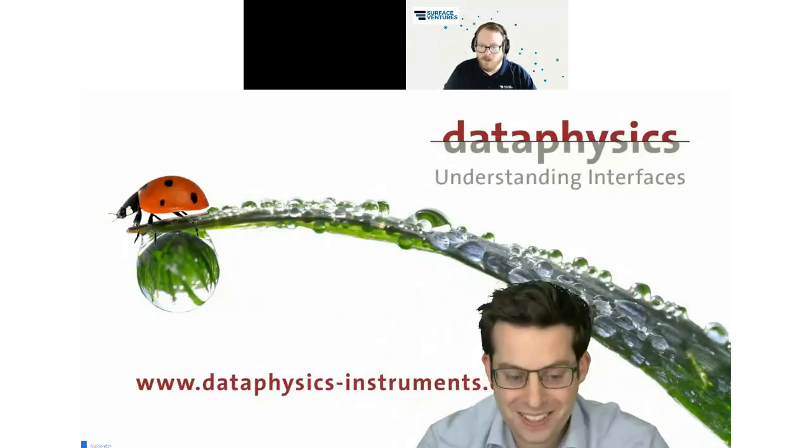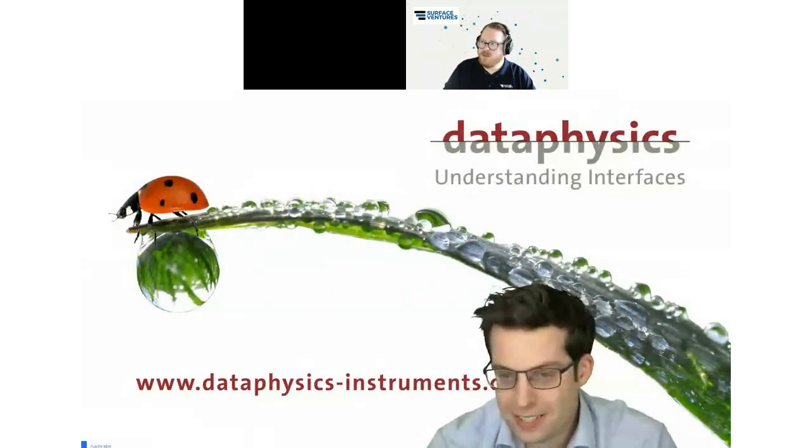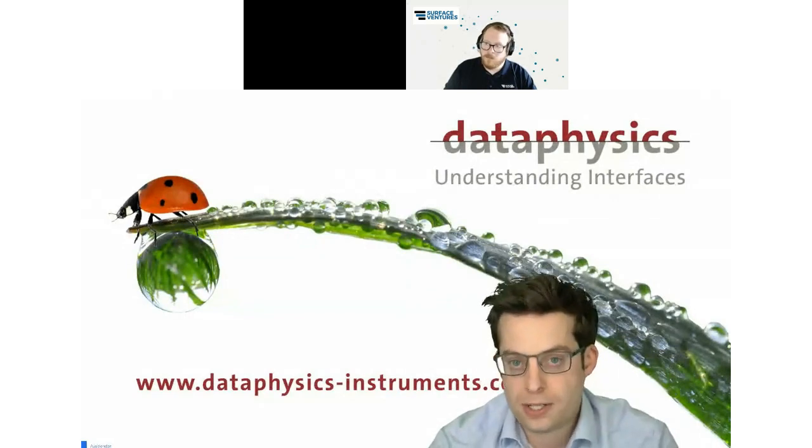Okay, we got one there. Do you have to have special software for the imaginary contact angle measurements? No, it's included in our standard software.